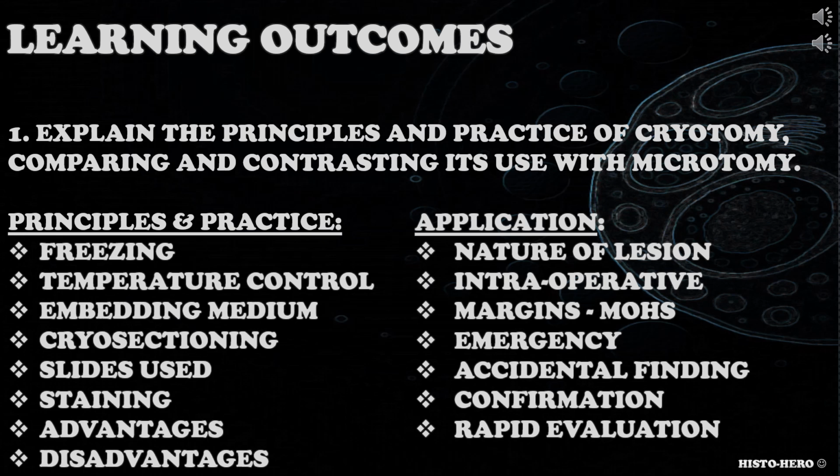Let's explore the first learning outcome, which is for the candidate to explain the principles and practice of cryotomy, comparing and contrasting its use with microtomy. What are the principles and practice of cryotomy? How do they differ from microtomy? Consider freezing, temperature control, embedding medium, cryosectioning, staining, advantages and disadvantages.